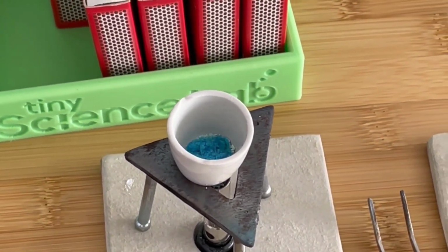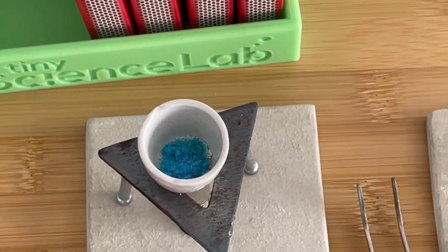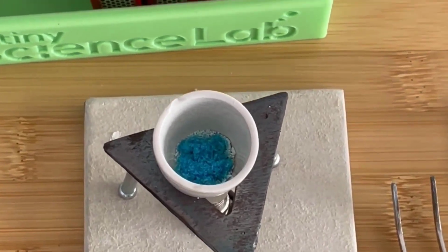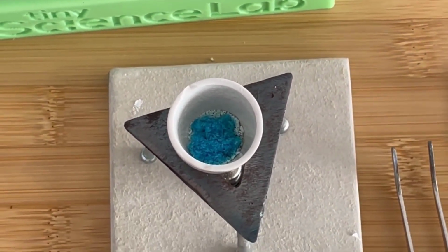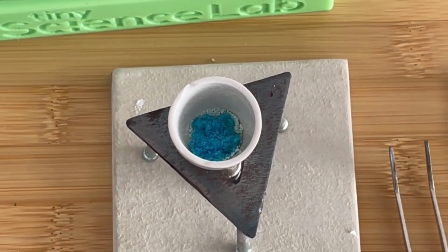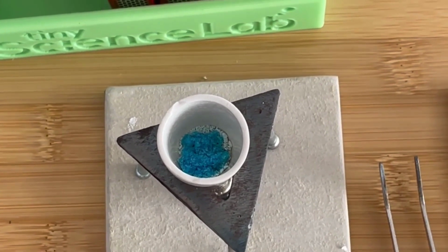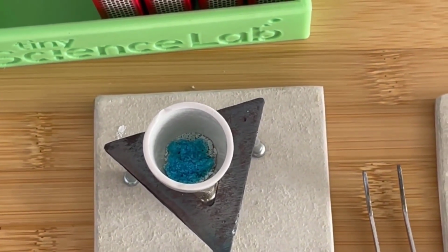So these beautiful blue crystals are characteristic of the hydrated form of copper sulfate, and what we're looking for is the dehydrated form, which is the form that has all of the water driven out of it. And you can see some of the steam that's been rising out of the crystal structures where the water molecules are locked up. You can see that the color pales, it's almost white.